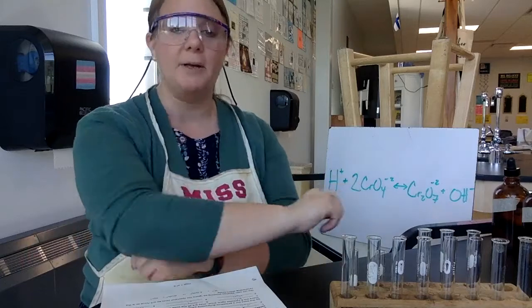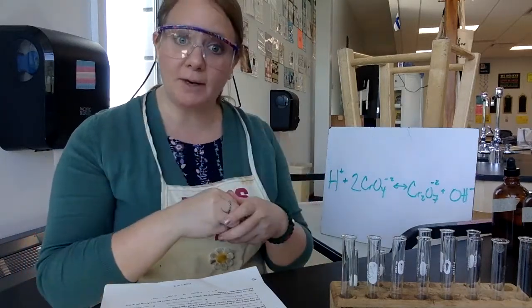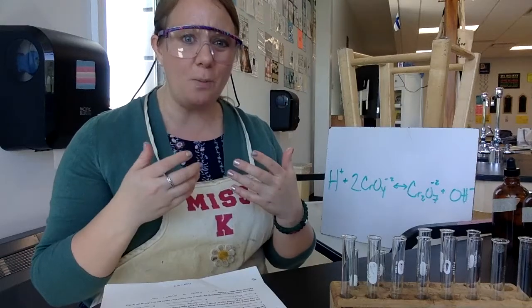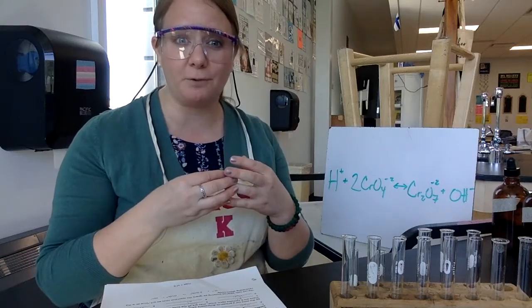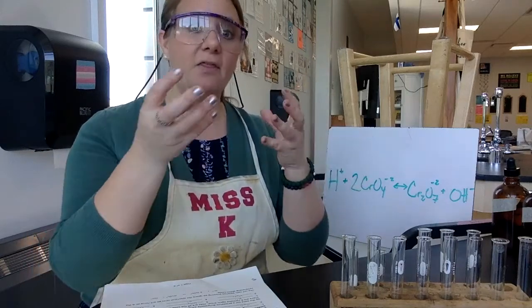That's the pre-lab. The purpose of that pre-lab was to get you to think about the fact that if you have an aqueous solution, you've got a whole bunch of different particles that are actually floating around, things like water, H plus, OH minus, and then the particles of whatever you've mixed in. If it's an ionic compound, it's split into its ions.